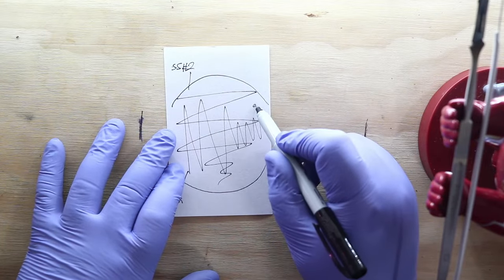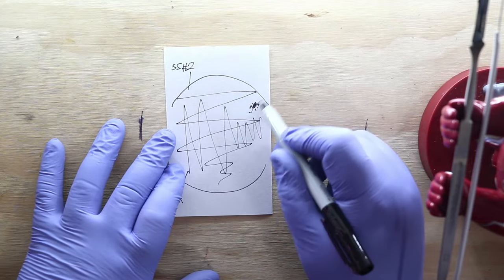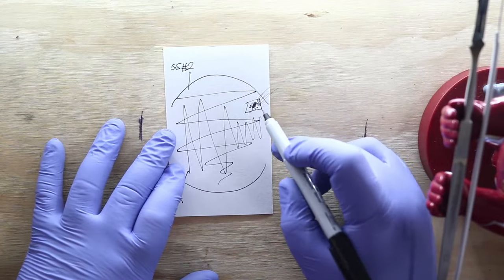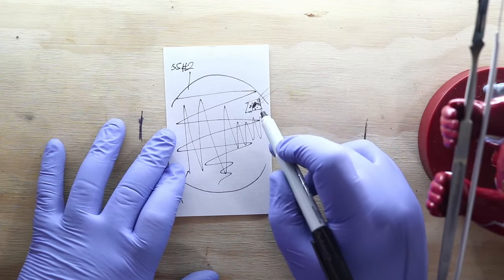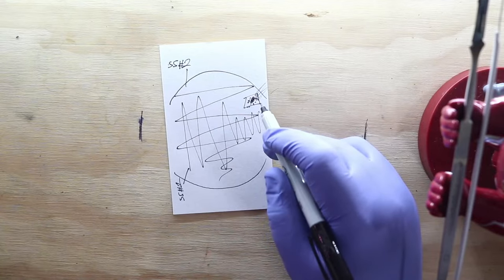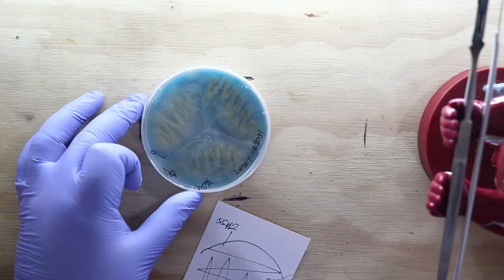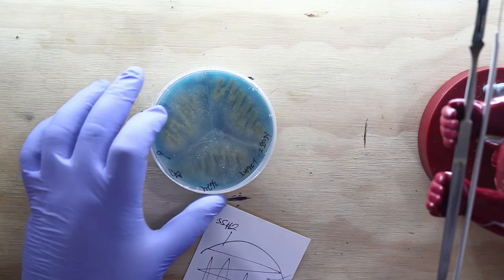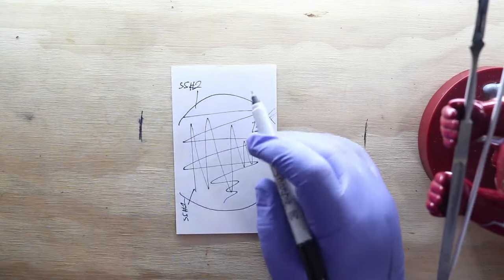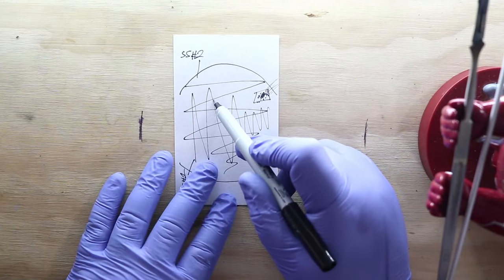Like, if I see growth over here, I'm going to cut that out immediately, because that's probably mold. You want to get to it before it turns colors, and by that I mean before it gets green or yellow. I don't know if you guys can see that. I'm going to open that up here in a minute. But why? That's a mold. Because I ain't scared. Now, what you're really looking for are these intersection points.